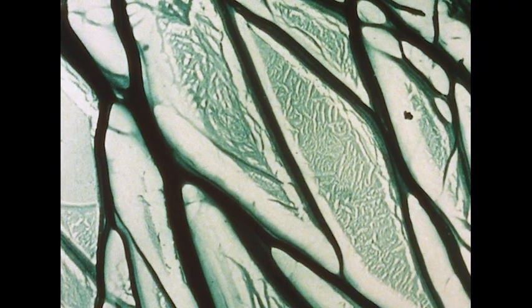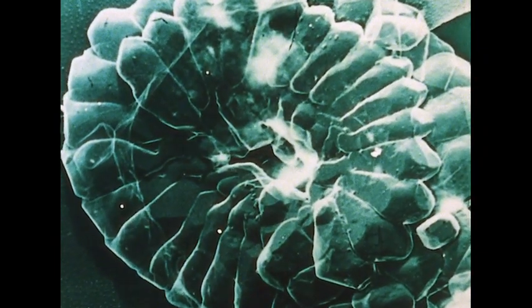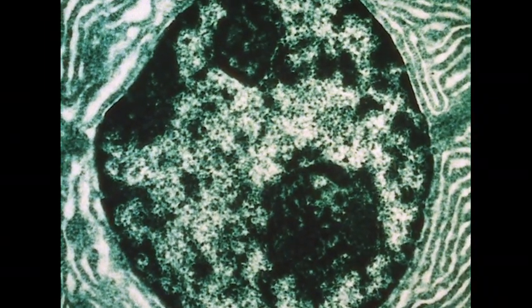of soap, of chalk, a human tissue cell, etched steel, and at the extreme power of the microscope, the atomic structure of a platinum compound, parallel lines of atoms 1/1,000,000th of a millimeter apart.